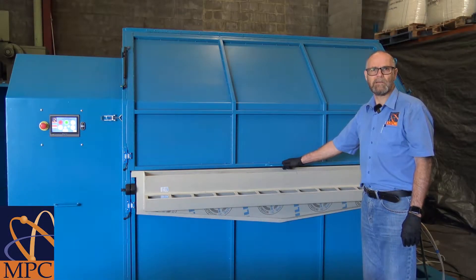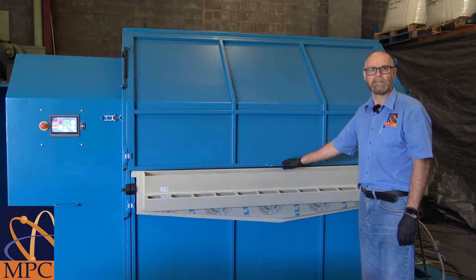I'm John Cooper from MPC and I'm happy to be showing you the steps involved in operating our PAL1000 Gold Assay System.